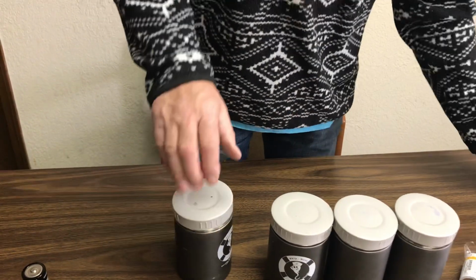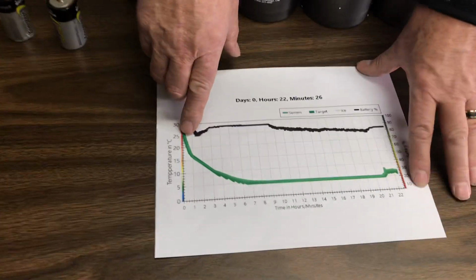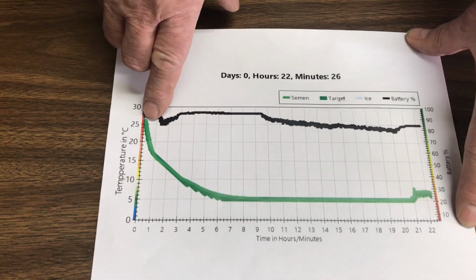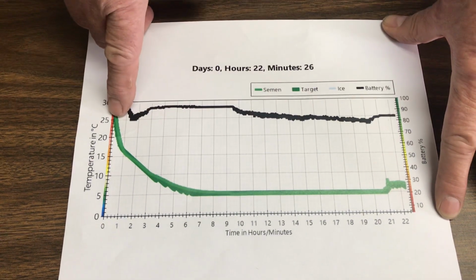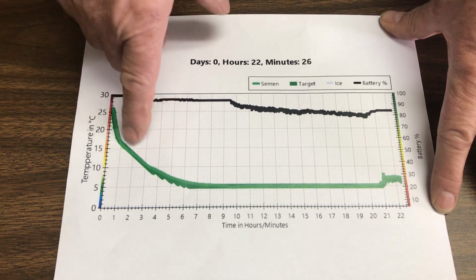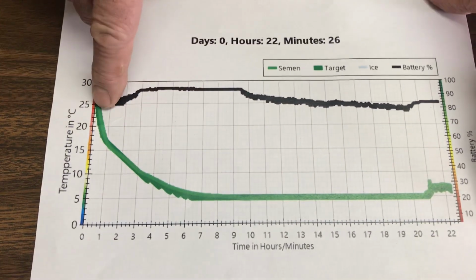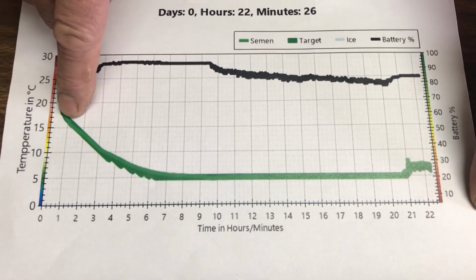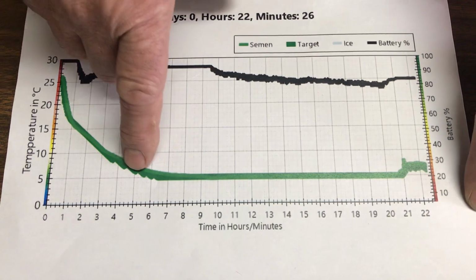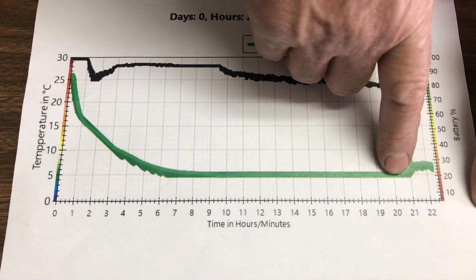And with that you generate a graph that shows you what happened. This was a 22-hour trip. It started off at room temperature. There's actually 2 lines here. One is the target temperature, which is the very faint green line, and the bolder jaggedy line is the actual temperature experienced. You can see it cooled down fairly quickly to 18 degrees. Another 4 hours to get to the target temperature of 5 degrees. Maintained it for the entire time.